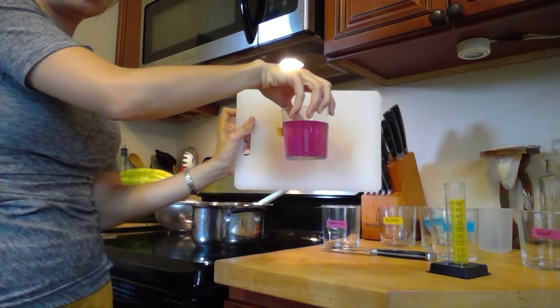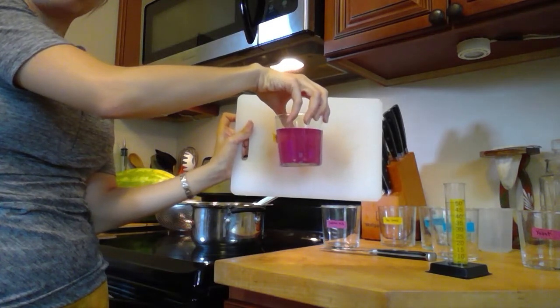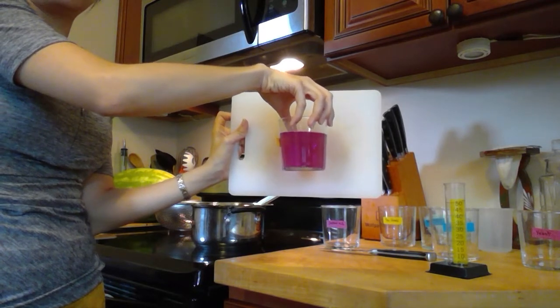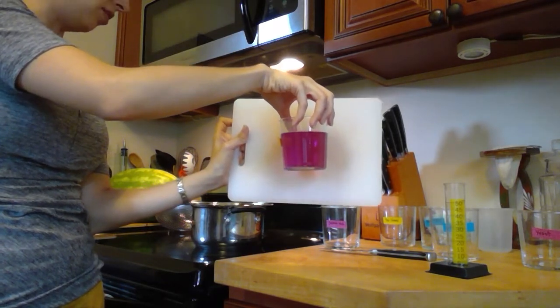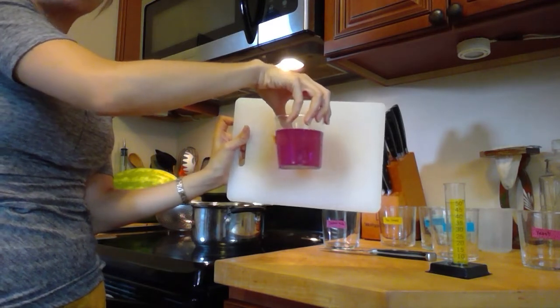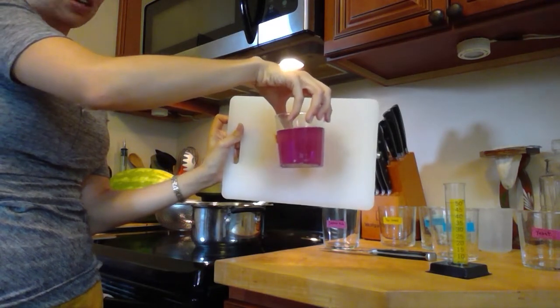Yeah, this is definitely lightened up. It got a little bit more to the purple-pink side of things as opposed to that really deep purple color that it started out with. Purple-blue color, I should say. And so I'd say, sure enough, this is acidic.